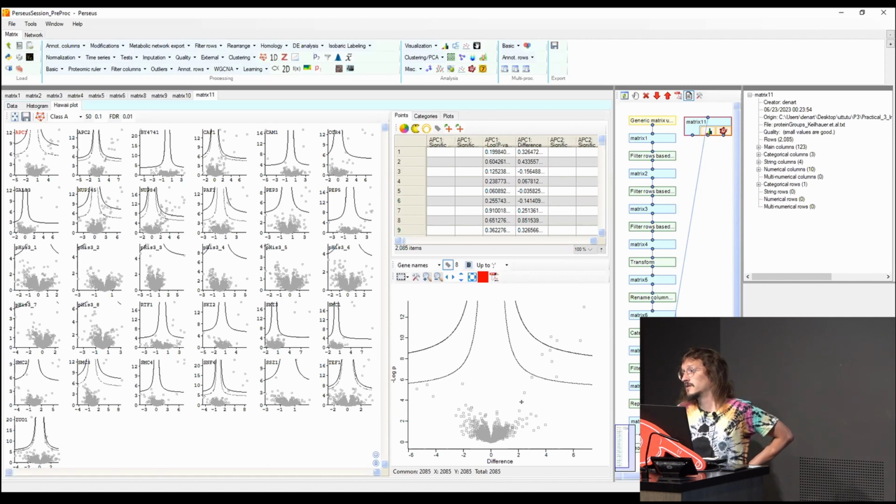If they have a higher correlation, they could be specific binders, and maybe you have them here because they are very low expressed proteins. So the lower expression made them appear less significant. If you see then that the correlation with the profile plot is ridiculous, then probably they were only some unspecific binder in such large quantity in this experiment that they may have appeared as specific binders.